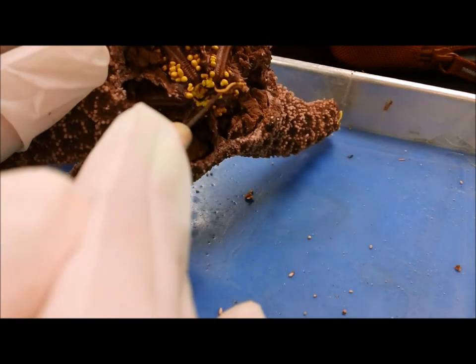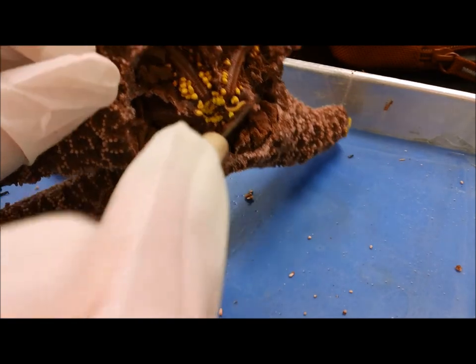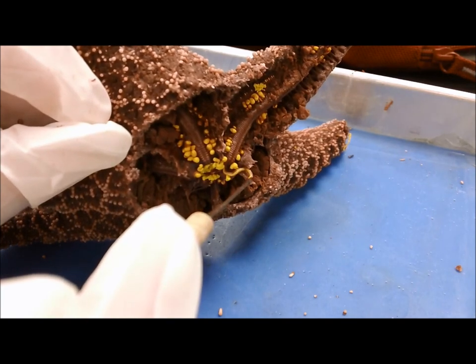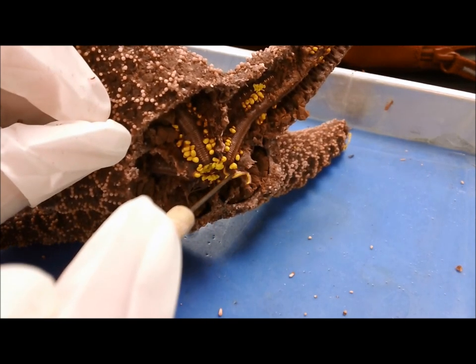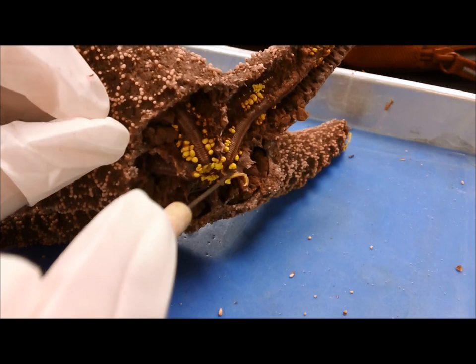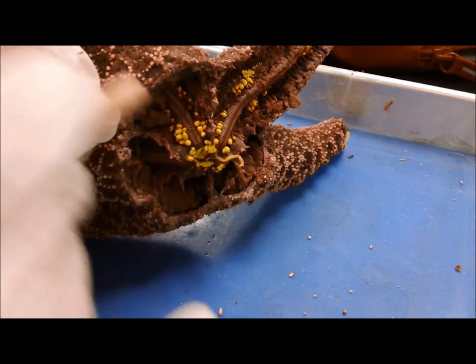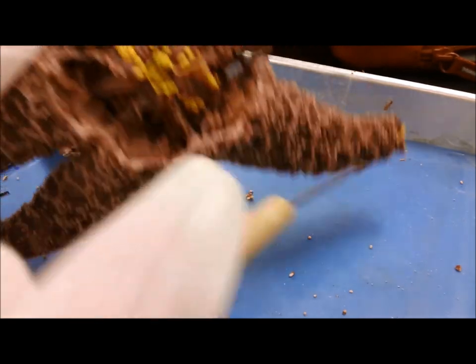And that right there — do you see this little tube-like thing that's yellow? That went up to the madreporite, the little sieve plate, the little pressure release. So if it needs to release a lot of water — if there's too much water pressure in there — water would come out through there.